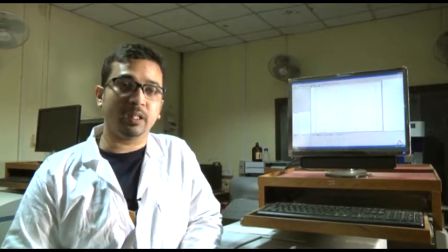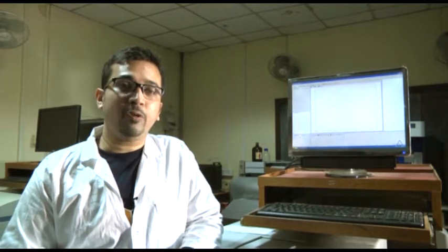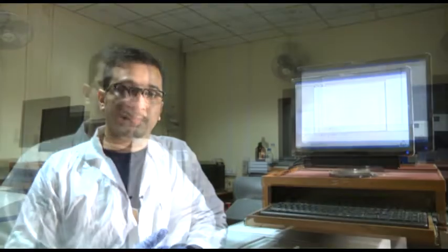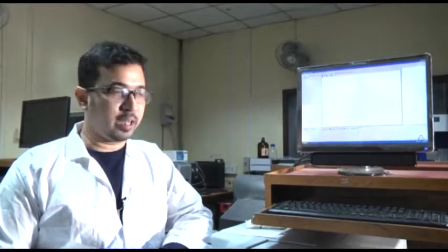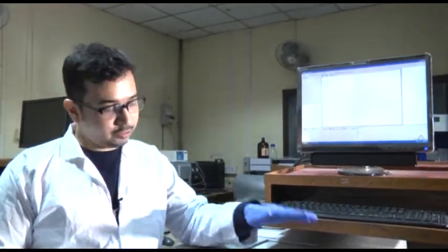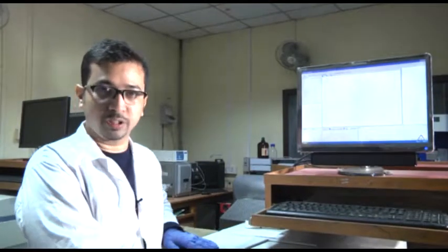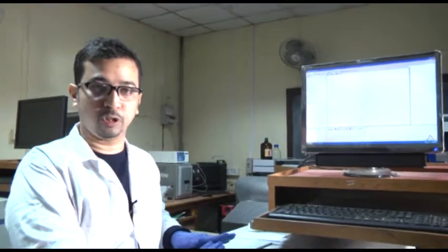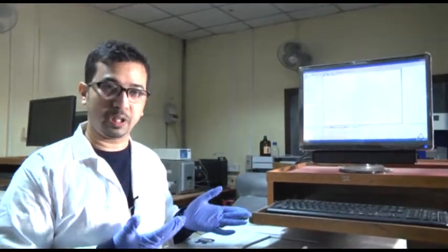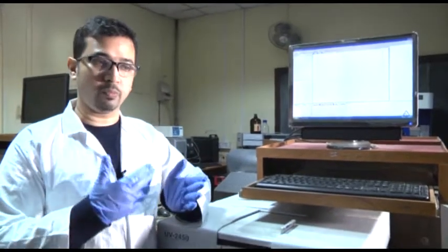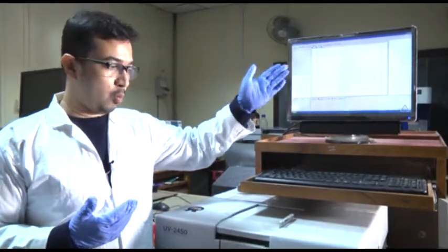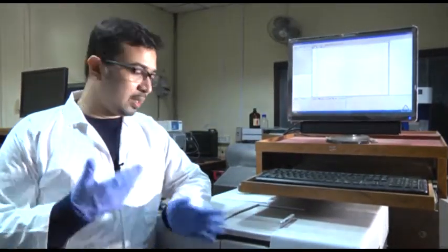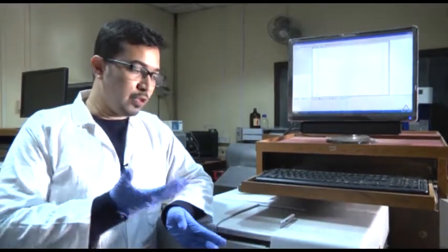Let us start with our experimental methods. Before starting this experiment, we have to get acquainted with the instrument. Let us see how the UV instrument looks. For UV visible spectroscopy, we need a UV instrument. UV instruments are of various types and one of this type is shown here. This is the UV chamber which records the absorbance of protein or amino acid samples, and gives results detectable using software. The computer gives a UV spectrum showing absorbance values.